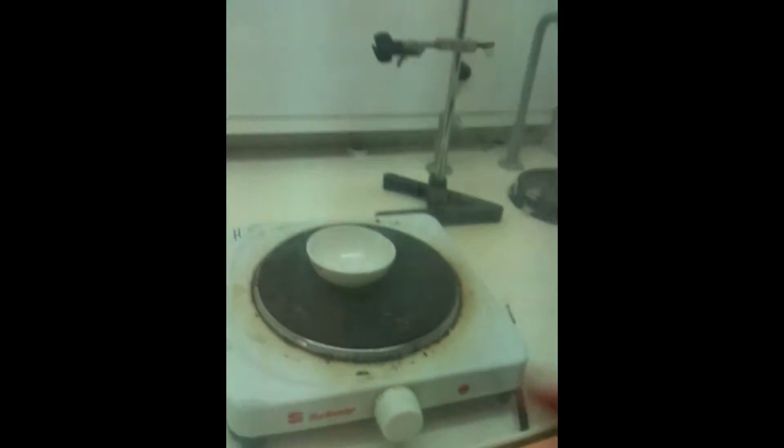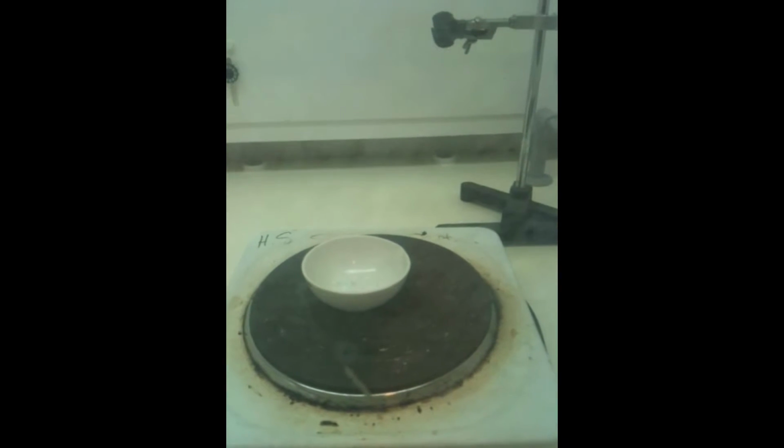Oh, look at his arms. They're super bulging, so strong. Okay, so now if it explodes, it won't do it in our face.